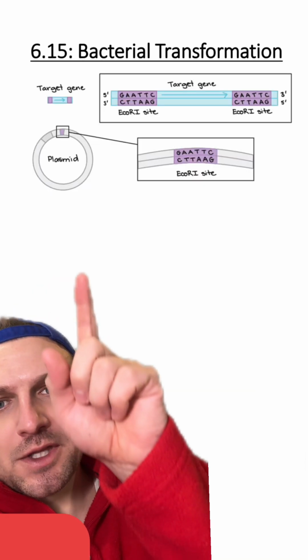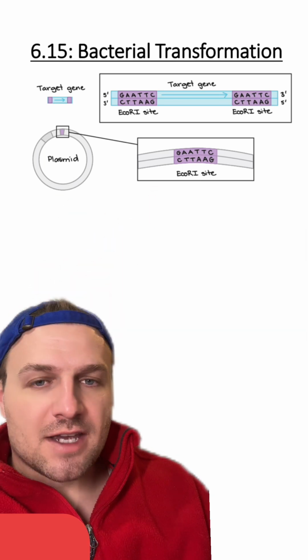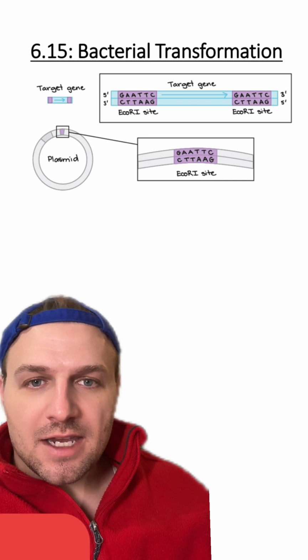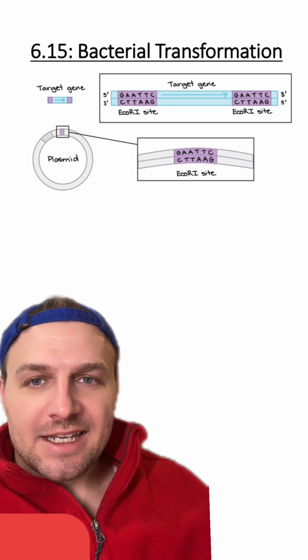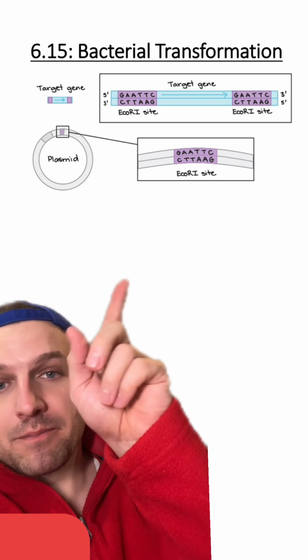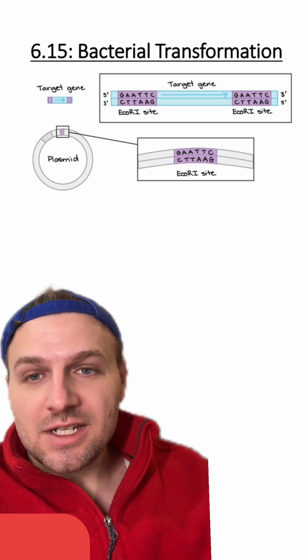Here's again an example of what this looks like. You can see this plasmid with the restriction enzyme. The restriction enzyme site is called EcoR1. And what happens is once we cut that site with a restriction enzyme, we can add in a gene with the same restriction enzyme cut on both ends. That again allows us to bind the target gene into the plasmid.